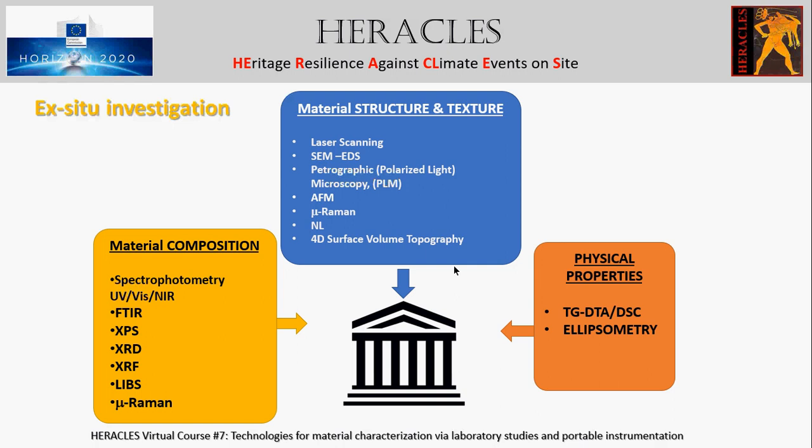X-ray photoelectron spectroscopy is another technique, which is a multi-elemental and non-destructive analytical tool providing chemical state information of the detected compounds and elements. It probes surfaces, but it can give bulk information by analyzing the cross-sections or pulverizing the sample. This technique has been widely used to analyze archaeological and artistic materials, generally in the characterization of coatings or patinas.